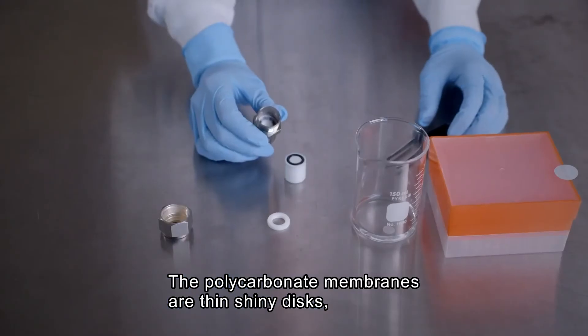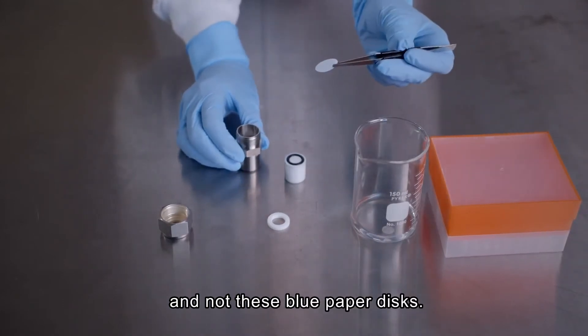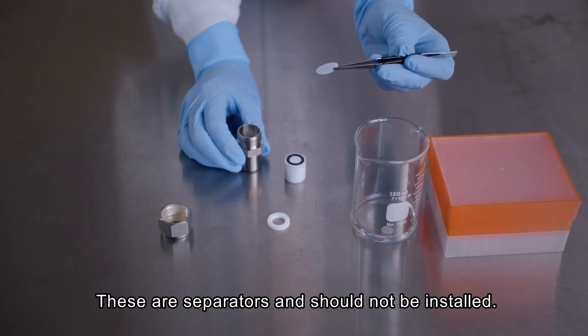As a note, the polycarbonate membranes are the thin, shiny discs — not to be confused with the blue paper discs, which are separators only used to separate individual membranes and should not be installed.